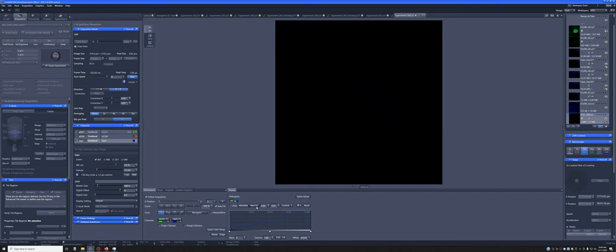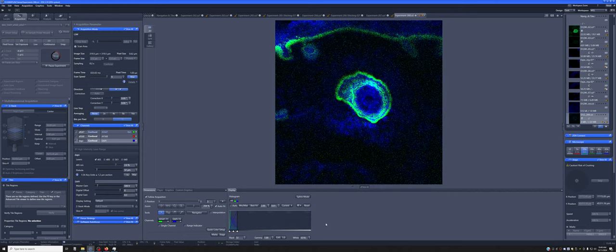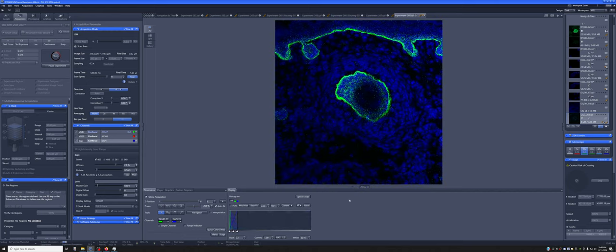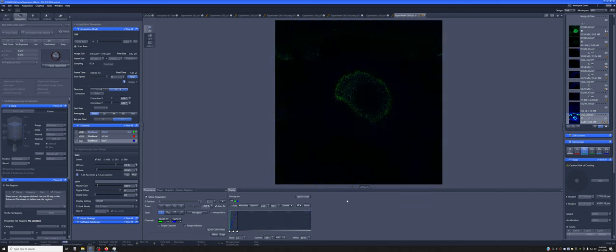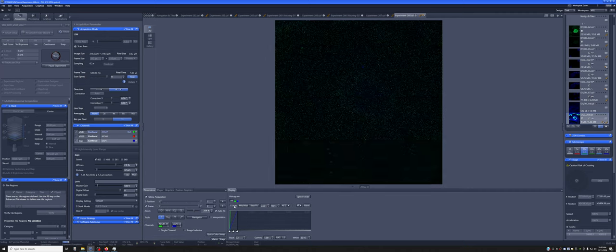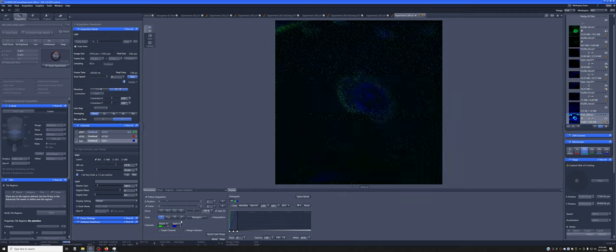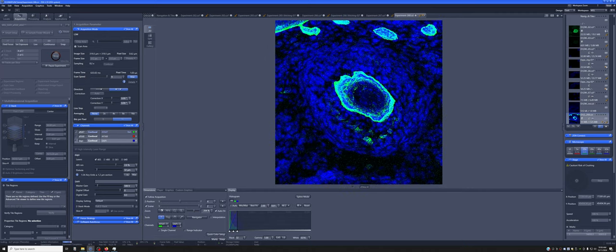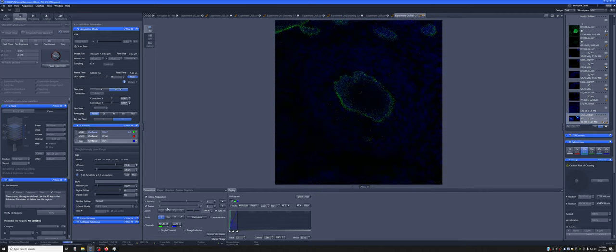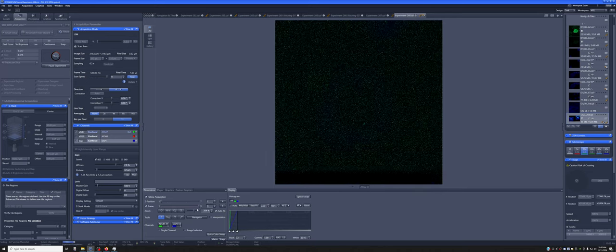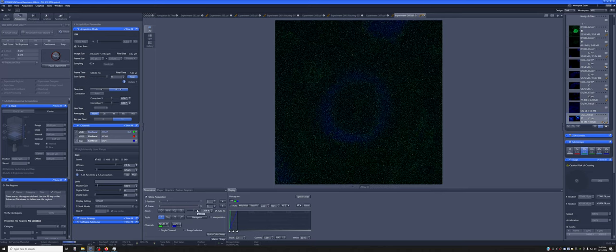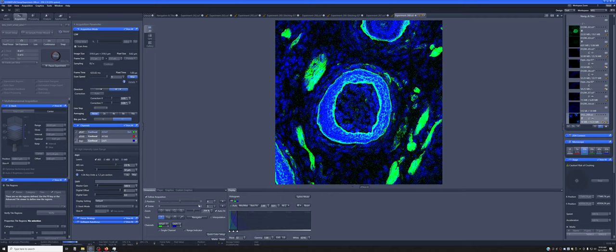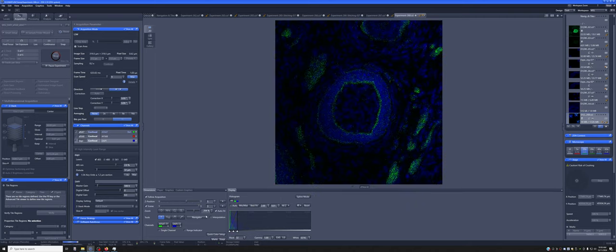So you can see that it is acquiring a Z-Stack at each of the multiple positions. And so this is a very crude Z-Stack just for the purposes of time. It's just seven positions.